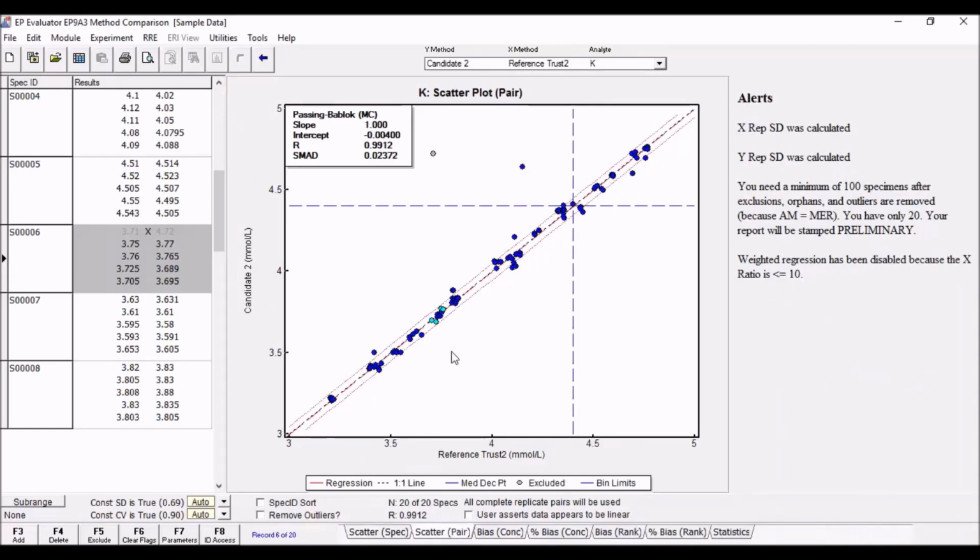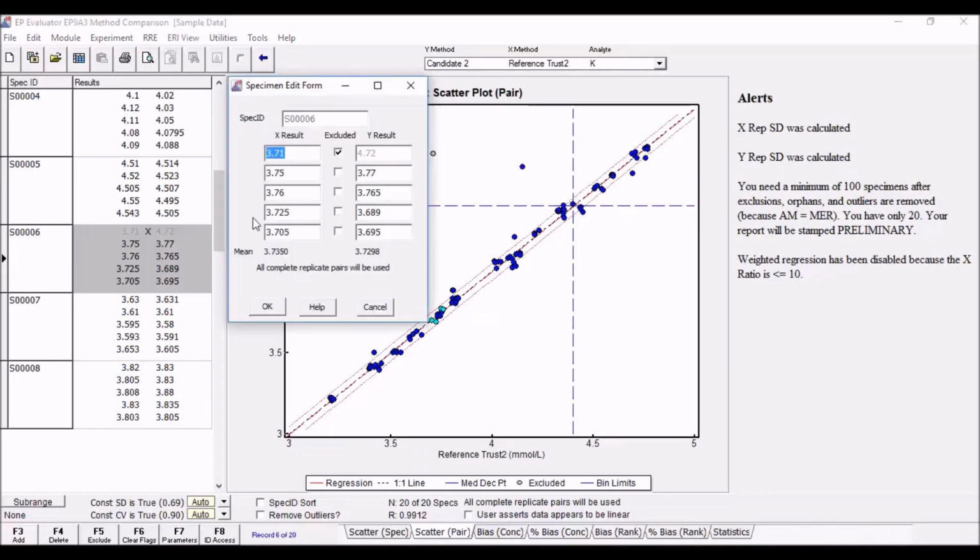We can also look at the new specimen pairs plot, where we can see the points showing every individual replicate pair, with the excluded outlier pair now well above, shown in grey as it's been manually excluded. We can also see the close grouping of the rest of the replicate pairs for that specimen below. So clearly the outlier was anomalous and should have been excluded.